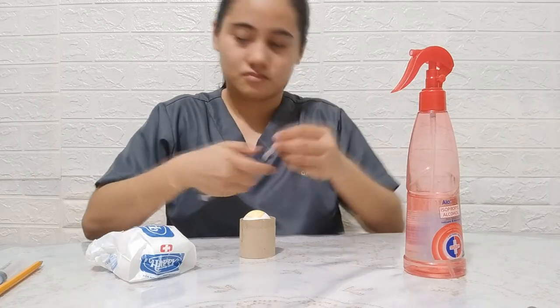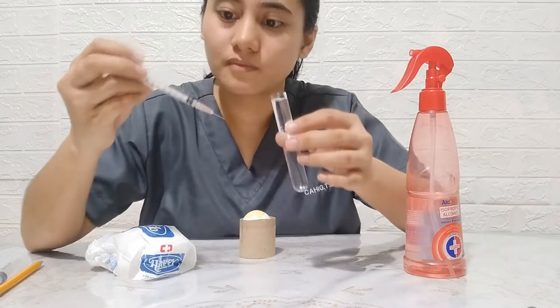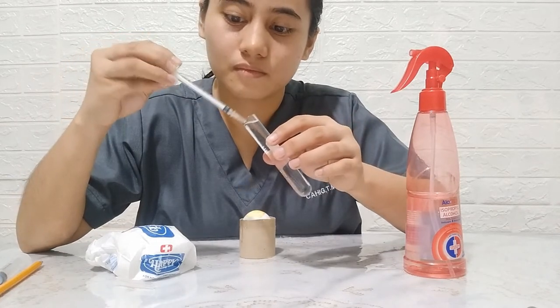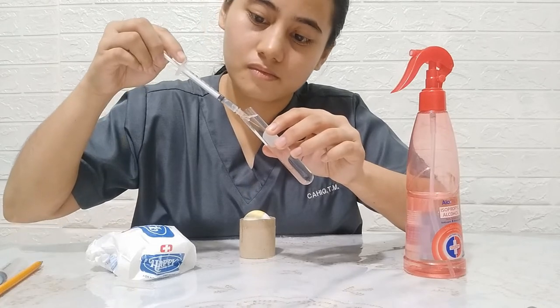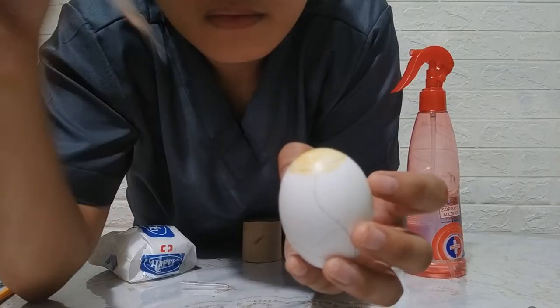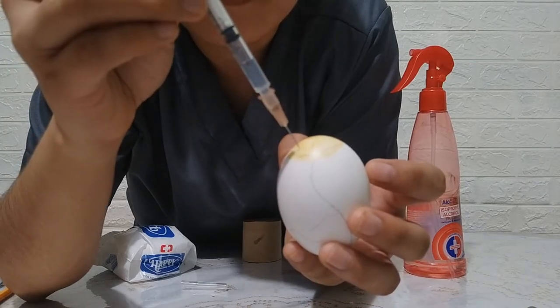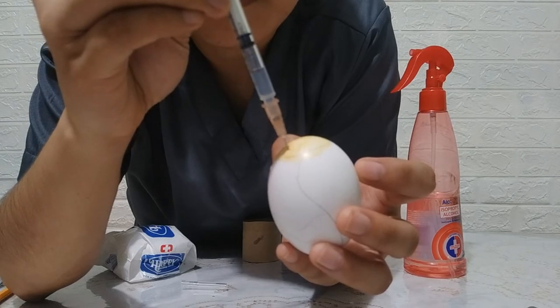Using another syringe, draw 0.1 ml of water that will serve as the inoculum. Insert the needle perpendicularly through the hole to a depth of at least 1.5 cm and deposit the inoculum.